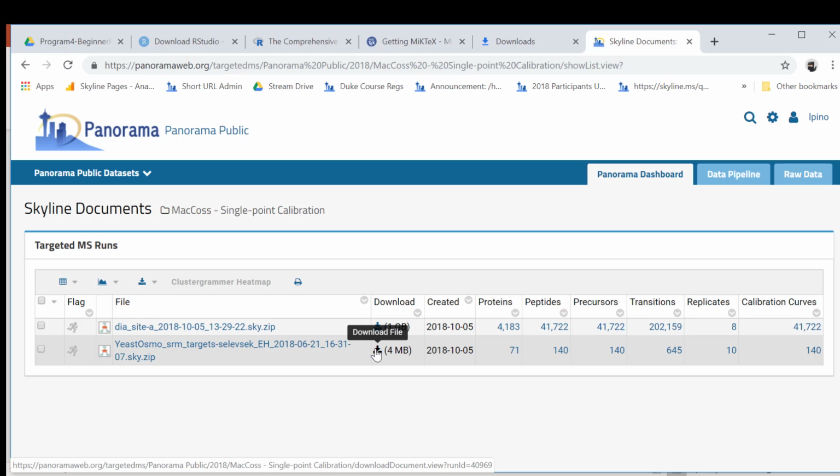Okay, that's a good question. I'm not much familiar with DDA, but if you already have everything on Panorama, do you even need a proteome exchange ID? For the raw data needs to have a proteome exchange ID. So Panorama.